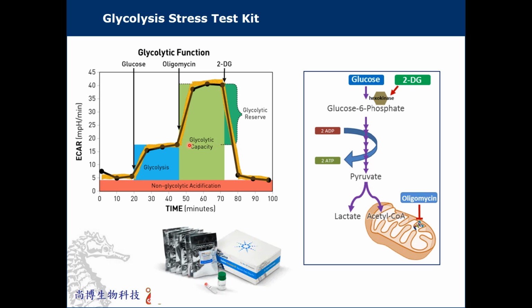And because your mitochondria is too poor, no feedback is needed. So the signal will keep the same, no change. If your cell has very poor glycolysis but good mitochondria, then if we shut down mitochondria, the poor glycolysis could not satisfy the energy demand of the cell, so the signal will decrease. Then the cell goes to death.